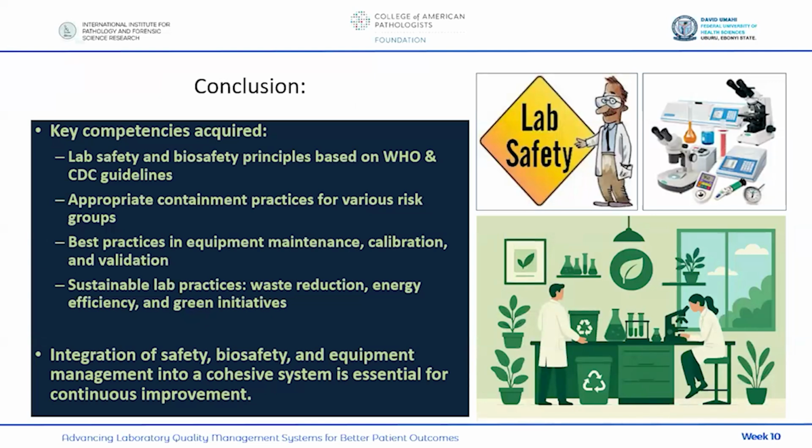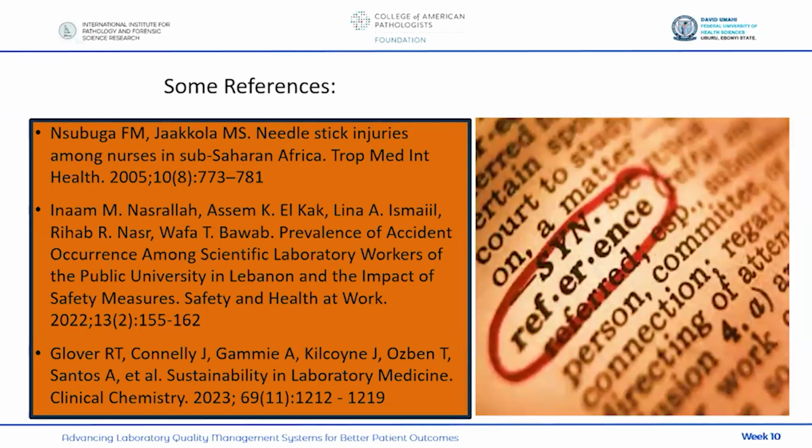So our time is fast spent. We need to conclude. So in this session, we have been able to talk about lab safety and biosafety principles, containment practices, equipment maintenance, and then we talked about sustainable lab practices. So in conclusion, integration of safety, biosafety, and equipment management into a cohesive system is essential for our continuous improvement. And a transition to sustainable lab practices is also a strategic necessity to ensure long-term viability of healthcare systems, not just in Nigeria, but globally. Okay, so thank you for listening. These are some of my references.